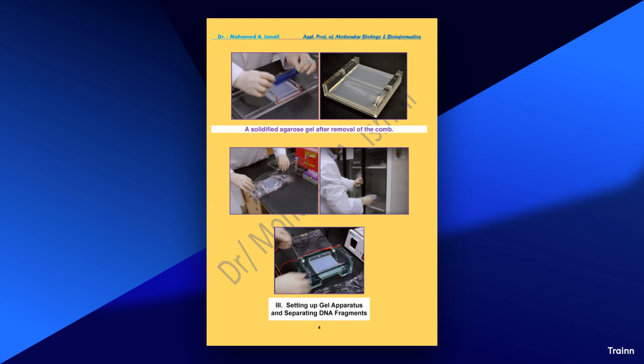3. Errors during electrophoresis. A. Incorrect voltage setting. Error: applying too high or too low voltage can affect migration rates. Impact: high voltage can cause band distortion or overheating, while low voltage can result in poor separation. Solution: use a voltage setting appropriate for the gel size and thickness, typically between 80 to 150 volts.